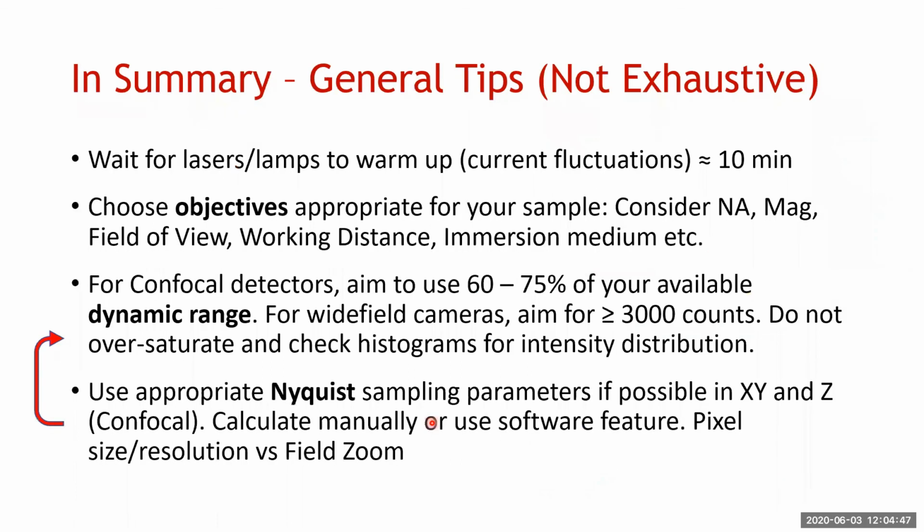So in summary, again, not exhaustive, but if you're getting onto a microscope, what we wanted to do was just to give you an idea of all the different things you get into your head before you start the experiment. And if you get into a habit of this, then you don't have to think about this every time, obviously. But we want you to get the most out of the microscope so that when you get off that microscope and end up trying to analyze data for 3 months, that you actually have useful data, or data that you don't have to go back and re-image.